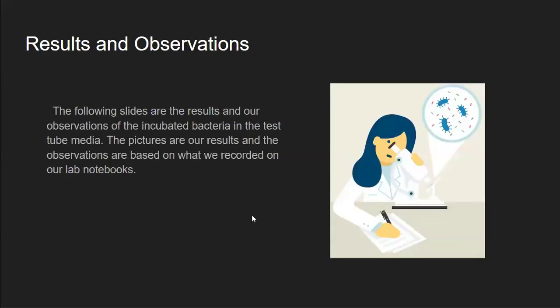The results and observations. The following slides are the results and our observations of the incubated bacteria in the test tube media. The pictures are our results and the observations based on what we recorded in our lab notebooks.